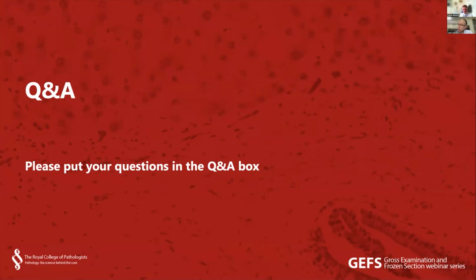Okay, thank you. Something similar, one of the candidates has asked: I was asked to take CRM in a high anterior resection specimen where the CRM was at least 50 millimeters away. I was confused. Would mentioning microscopic distance be enough in such a situation? That's a very good question. Again, a similar question, really. Often people would say that's enough.